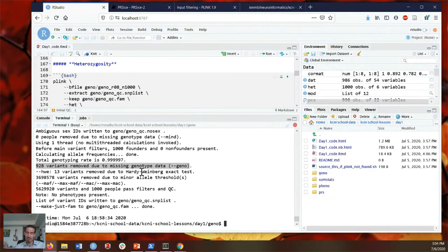When you get up to very, very large numbers, or if you have 9 million and most of your variants are being removed due to missingness, it tells you that maybe something went wrong in a previous step, a merging step, bringing chromosomes together, or translating from different file formats like VCF or BCF into the Plink binary file system. Each one of these just gives you an idea of where you stand with the overall quality of the data set that you're working with.